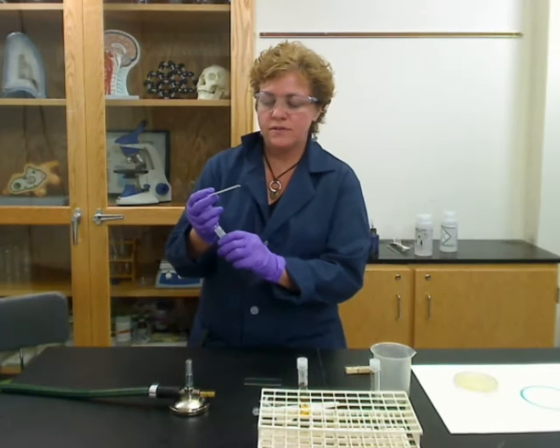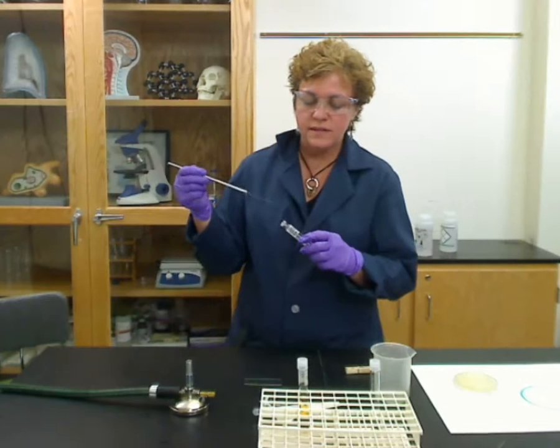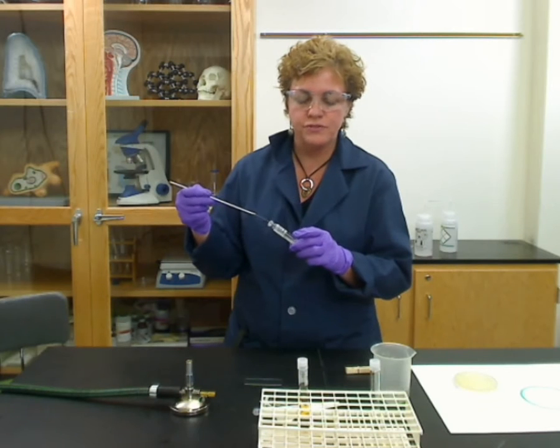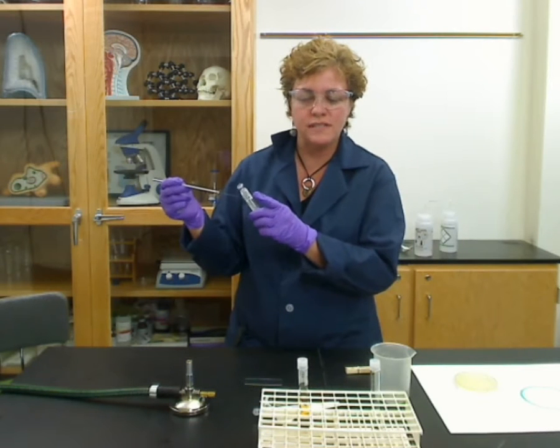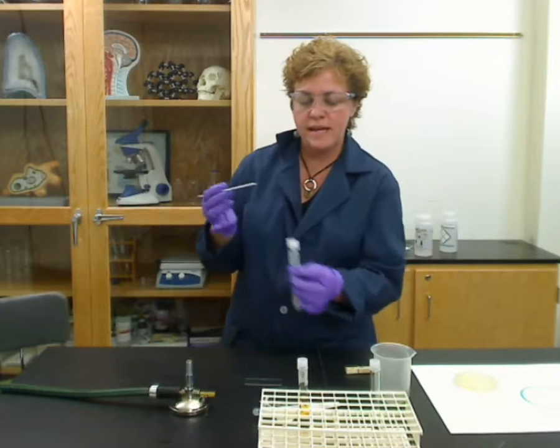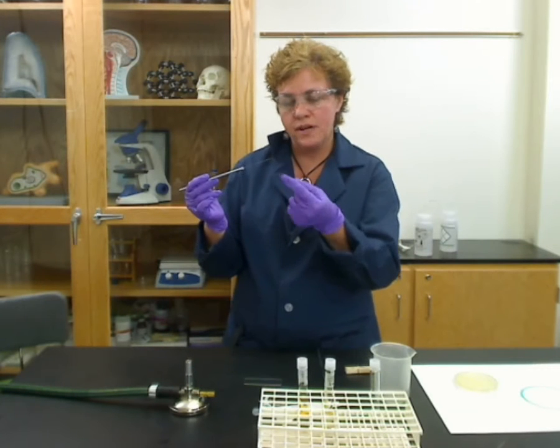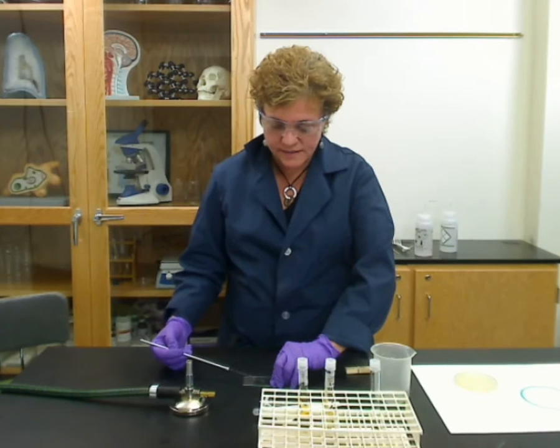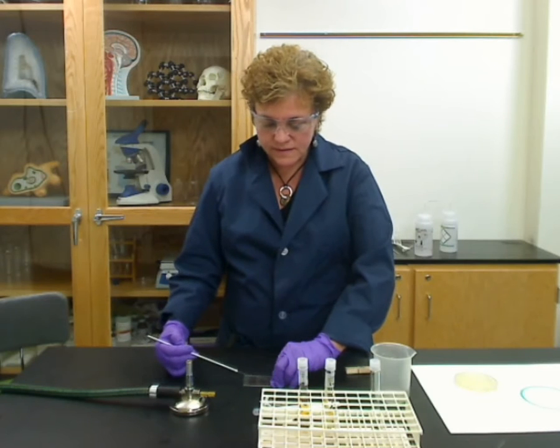Then you're going to open your culture. Make sure you haven't touched the tip to anything — flame it. You're going to go in with that sterilized loop and just barely touch the culture. You don't need much at all; a lot of times you don't even have to be able to see it on the loop. Remember which side you put it on, put it down on the slide, and spread it out as far as you can so it's nice and uniformly spread.